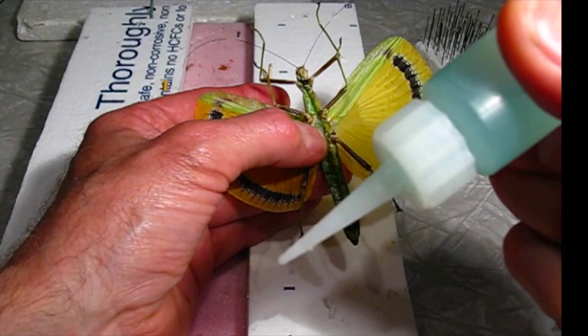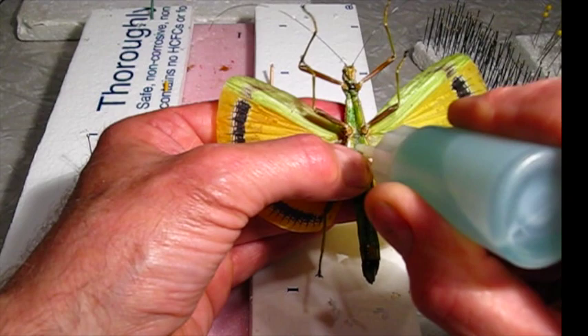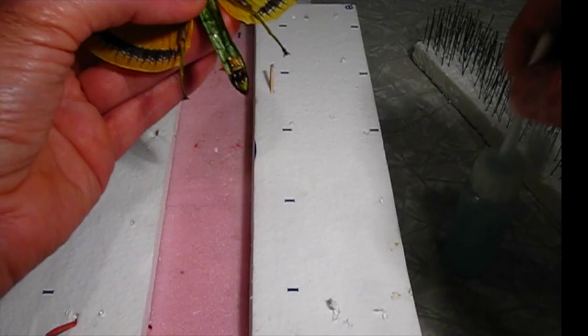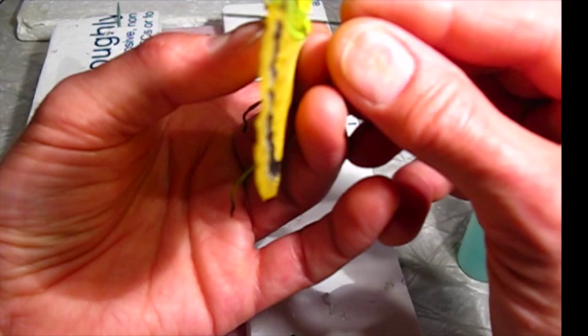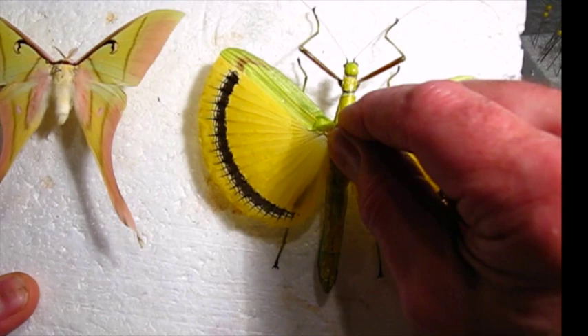I'm going to take some glue — I'm going to use this Blue Gel Clear water-based glue — and just squirt a bunch into that fiber so that it soaks in. And when the pin goes through, that should give it a good solid anchoring inside the thorax. I'll put my pin back in and make sure it's nice and straight.